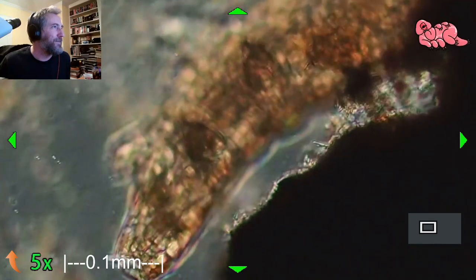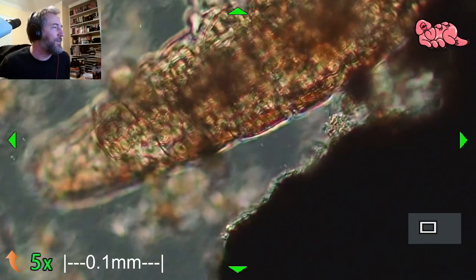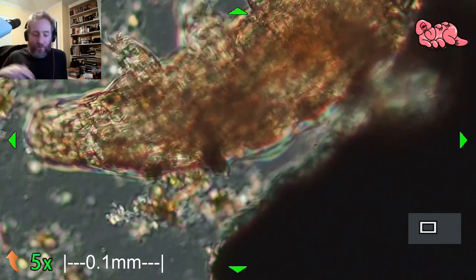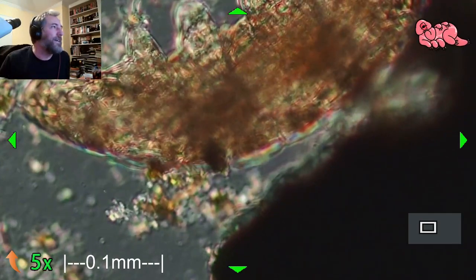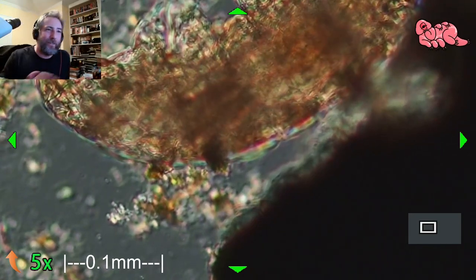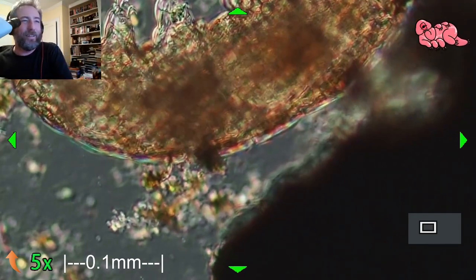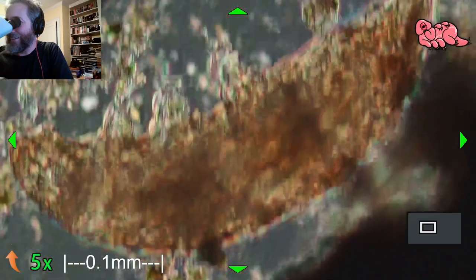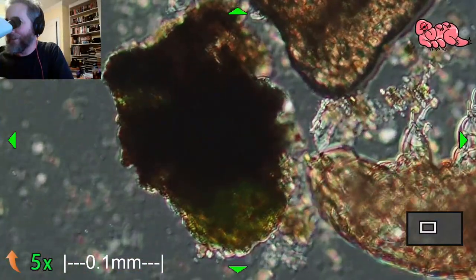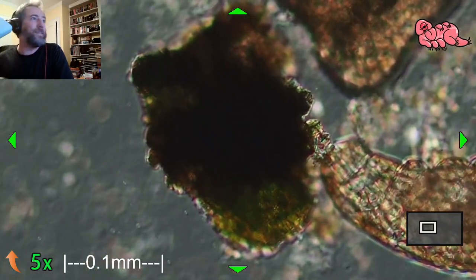And especially not, this one's really gorgeous. What a giant water bear. And I'm really glad I didn't put a cover slip on this, because it means that when I'm done, I can just rinse the slide off back into the sour cream container that I have, and then I can just dump it back into the yard and it'll be fine. Hopefully. Such a giant water bear.